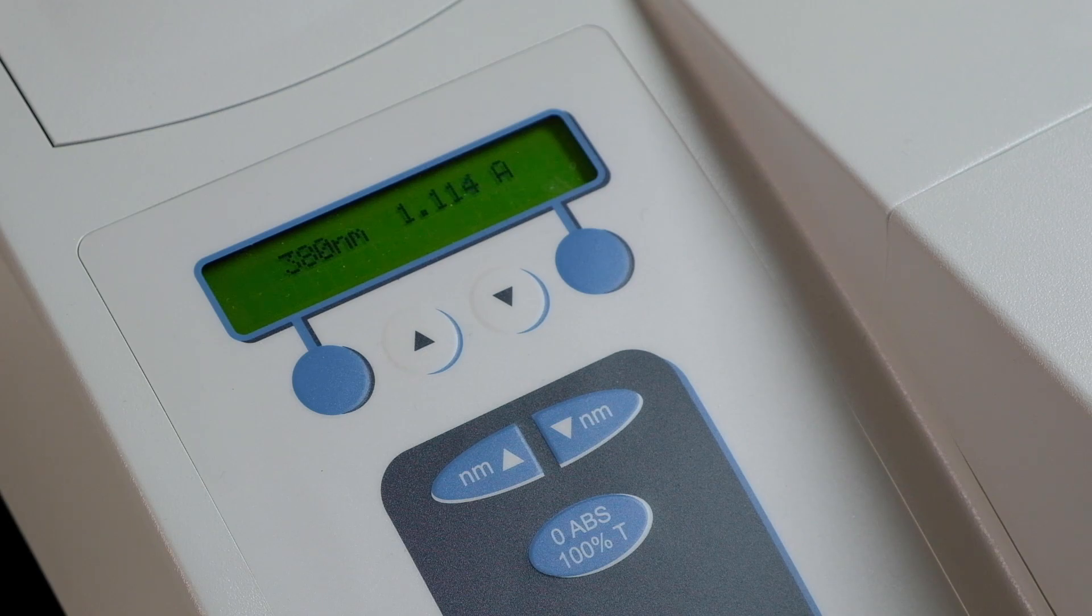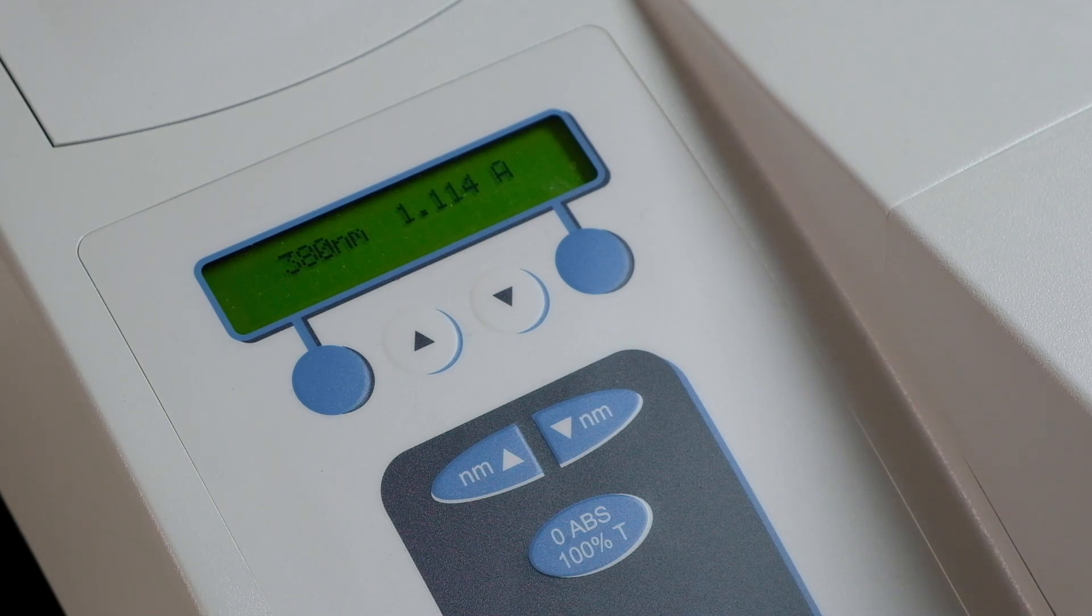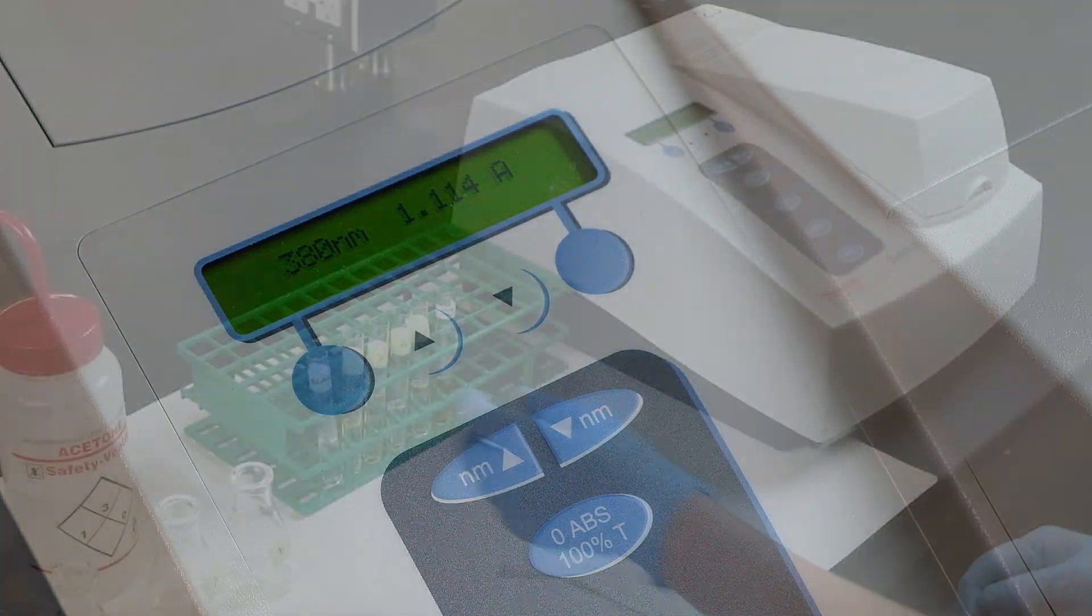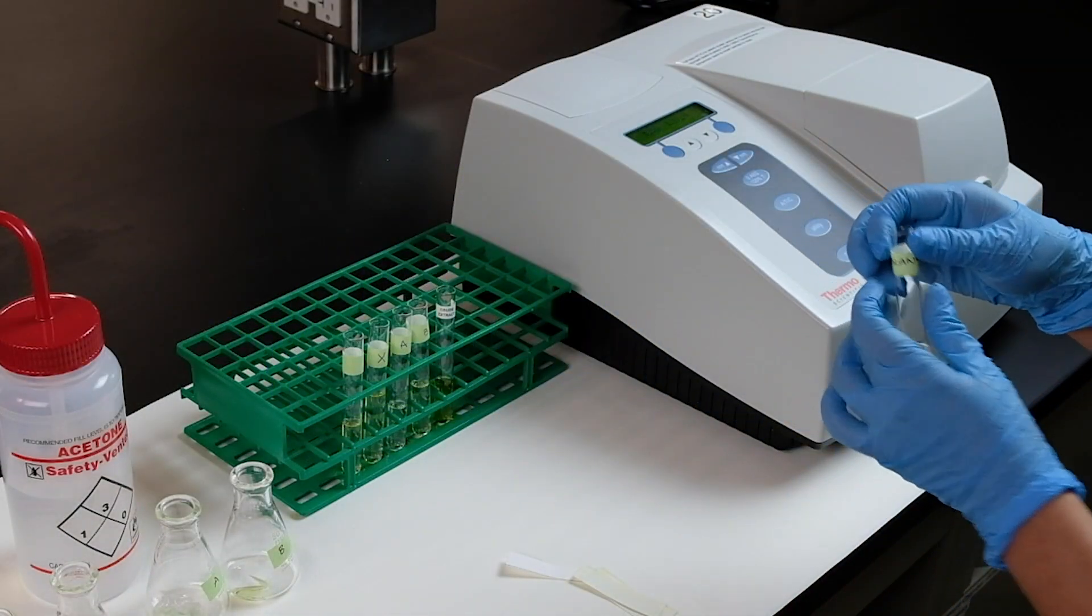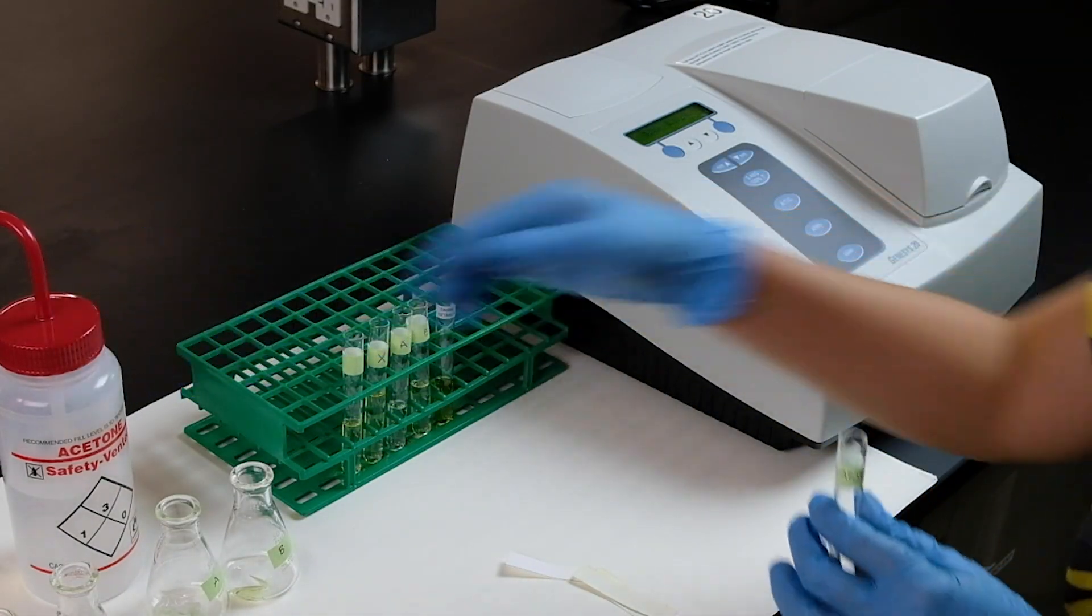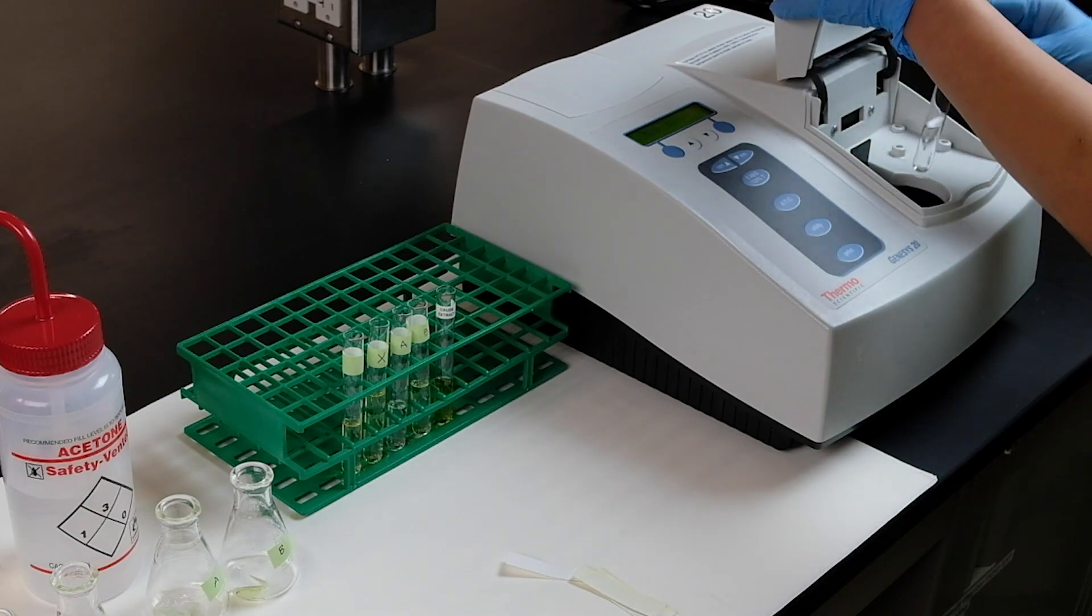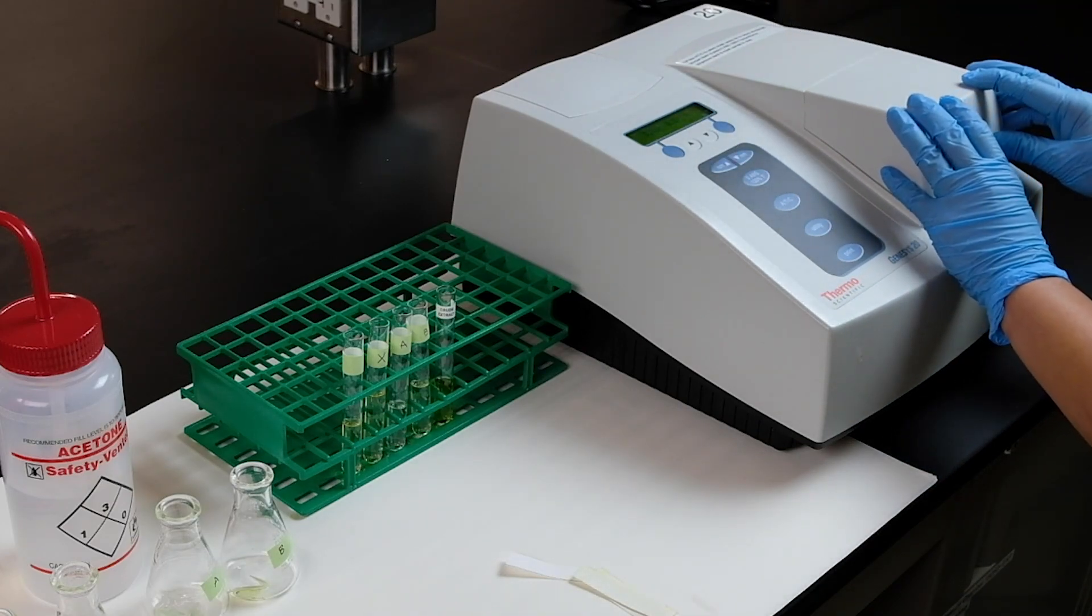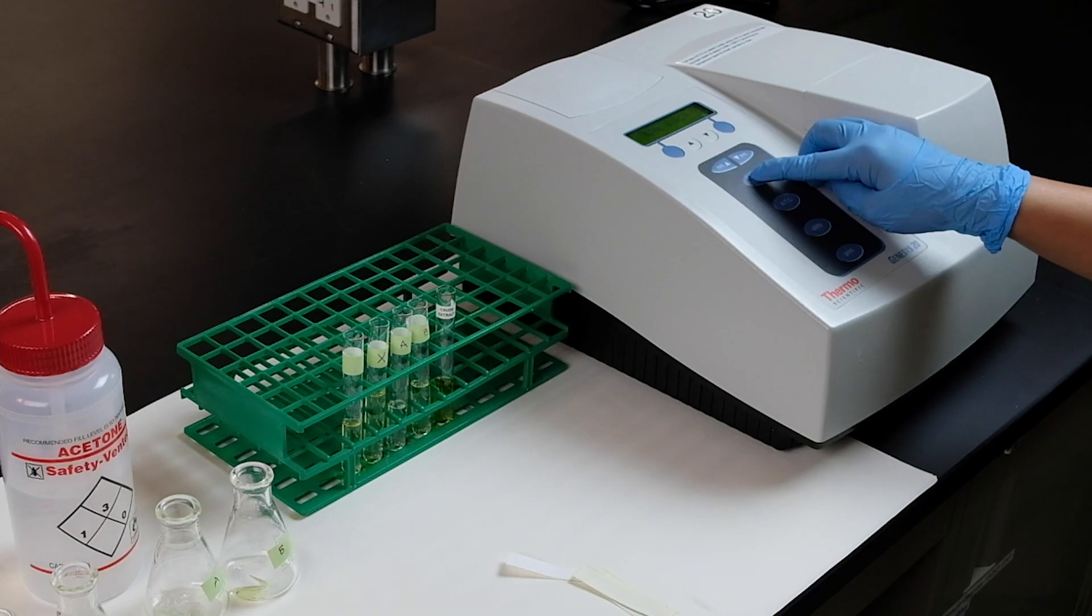Before each series, we have to blank before any reading. In this experiment, the blank would be 80% acetone. In order to blank it, you have a blank ready with your acetone, click it in the slot, and press 0 ABS.